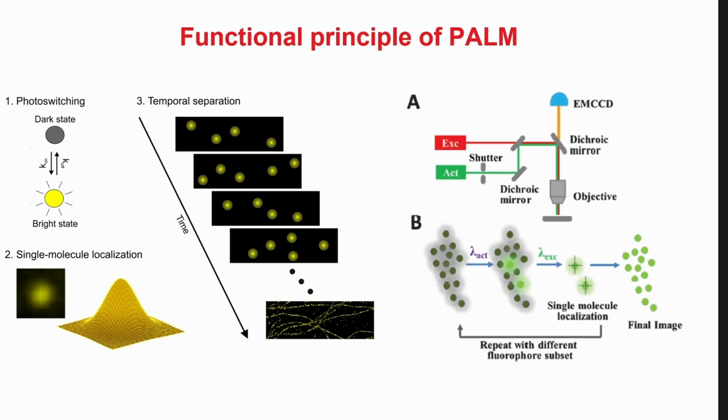But it does work. And it doesn't need anything much except for a high sensitivity camera, a dye which, when illuminated with, for example, a UV laser, excites the molecules, and then the molecules come back very slowly. And patience, a lot of patience. Live imaging is difficult because by the time you collect enough images, the cells may move on. And then you will not know whether the new spots that you see in the next image are more molecules or did the cells simply move on.